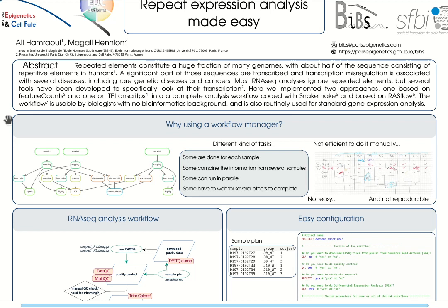So here we implemented 2 approaches in a complete analysis workflow that is coded with Snakemake, and the workflow is made to be used by biologists with no or little bioinformatics background.